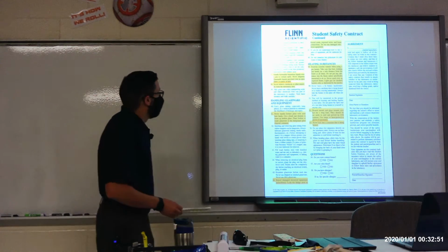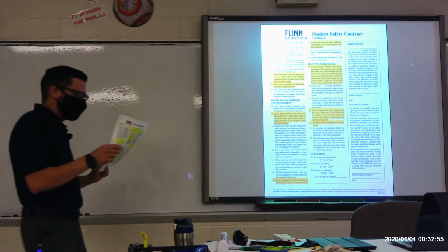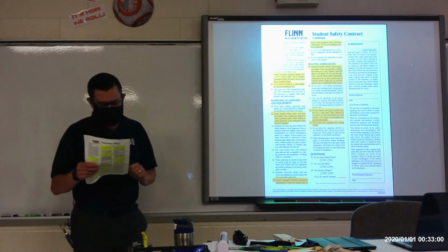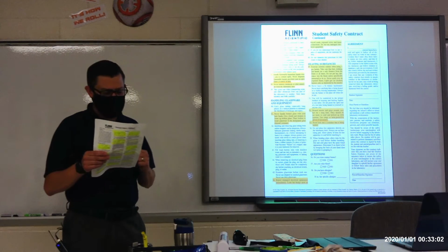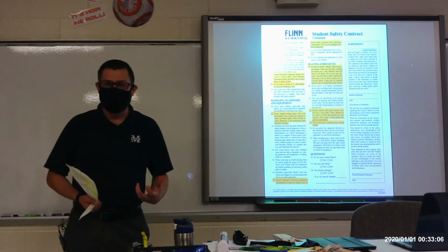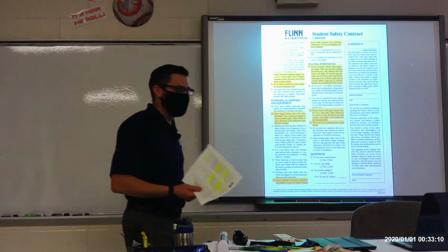Okay. All right, flipping to the back side, going down to number 37. Handle flammable hazardous liquids over a pan to contain spills. Never dispense flammable liquids anywhere near open flame or heat source. That's kind of common sense. If I have alcohol or gasoline or something like that, I don't want to be playing around fire with those.